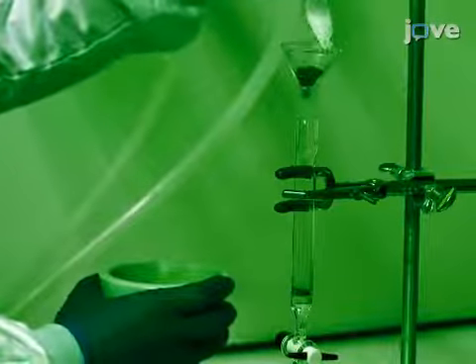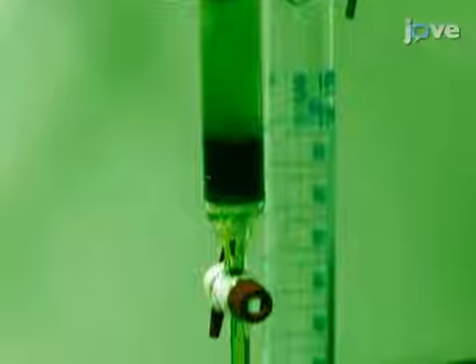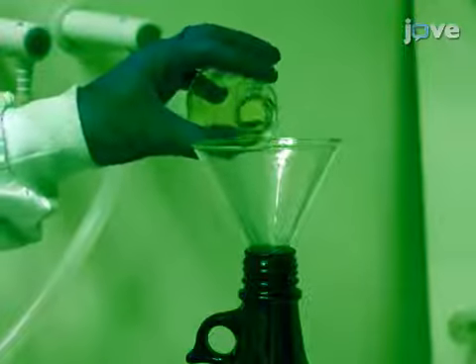Load the crushed cells onto a glass column and with about 50 to 100 milliliters of 100% acetone, wash the tissue to remove the carotenoids. After washing, discard the eluted orange-green fraction.